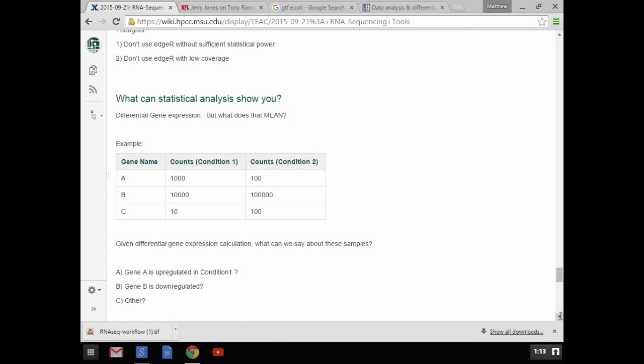Assuming that we were all able to edit all of those files to generate 4 new sequence count files, what we would have is 4 sequence count files, all of which look pretty much exactly like the one that I showed you earlier, which is gene name, count. What do you do with that? What are we trying to do with all of this data? What we're trying to do is get a list of differentially expressed genes.